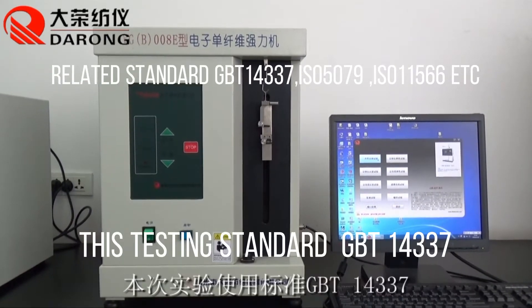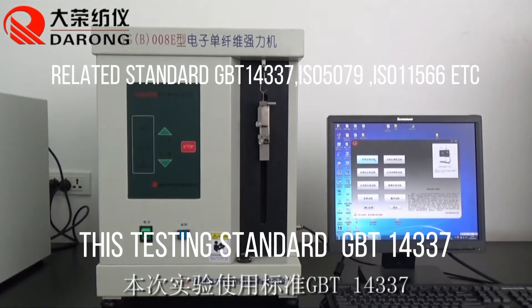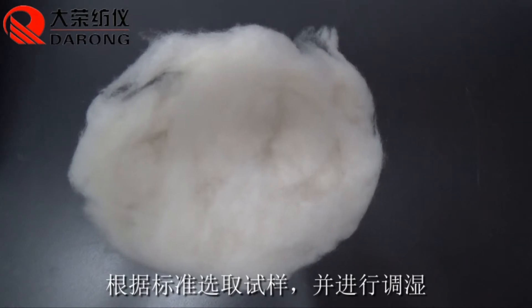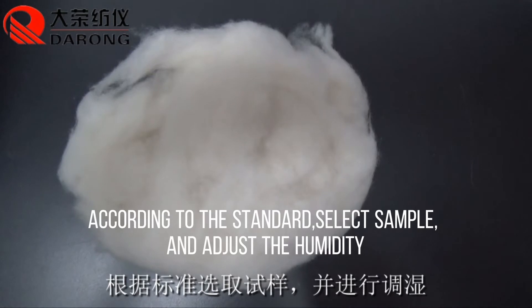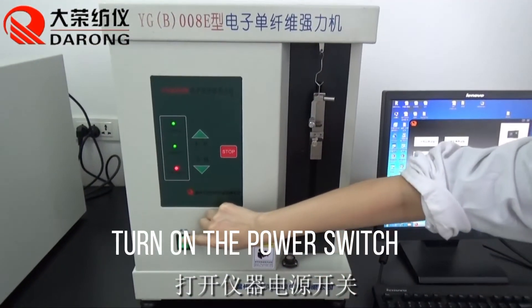The testing standard is GBT14337. According to the standard, set up and adjust the humidity. Then turn on the power switch.